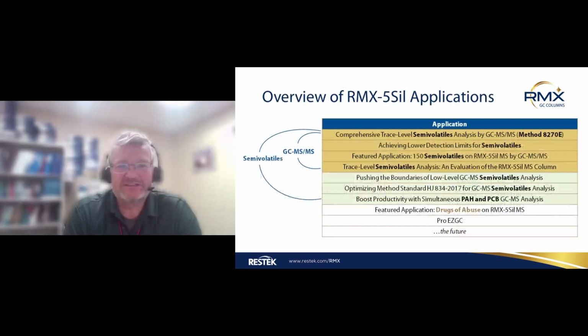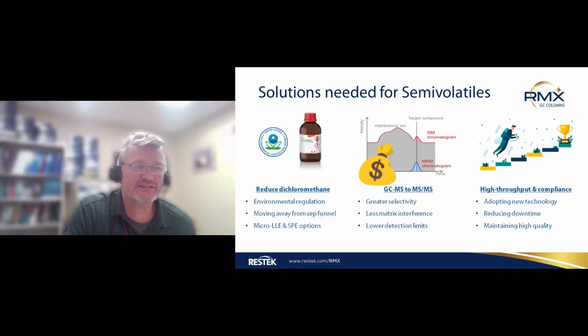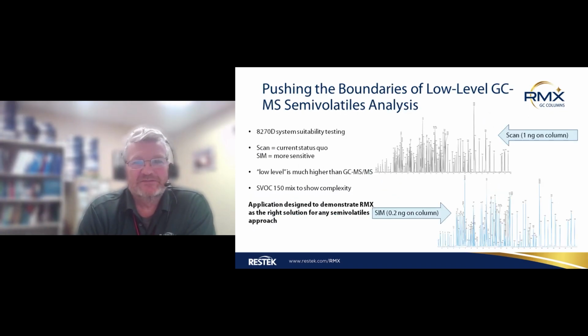So beyond the MSMS analyses, we can take a look at low-level single-ion monitoring by GCMS and regular GCMS applications. Again, the name of the game is to reduce the methylene chloride, so inject lower concentrations onto the column, which requires us to extract less. If we're able to switch from GCMS to MSMS, we can save a lot of money on the extraction side of things. We can also combine methods with MSMS because we reduce a lot of the background noise using that type of instrumentation.